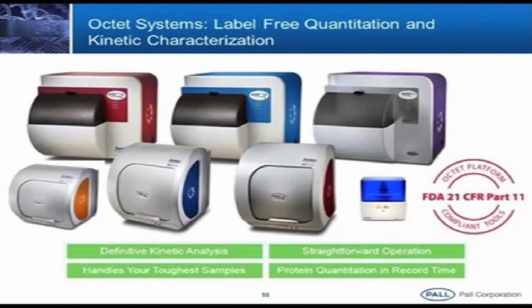So if I put in a 96 well plate, in one stretch it will pick up 96 sensors and go to the 96 well plate. You can read a quantitation in 2 minutes. So such a high throughput level.